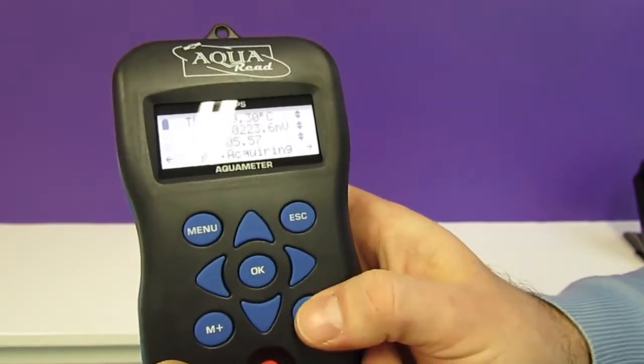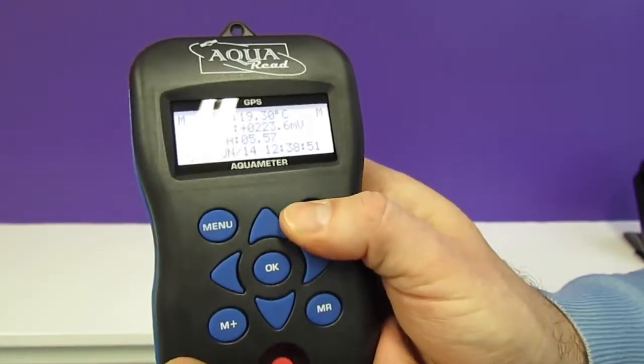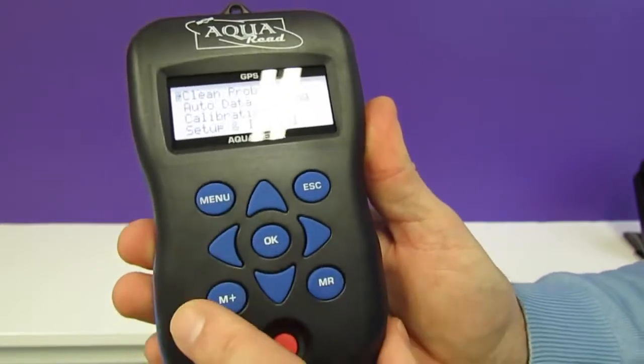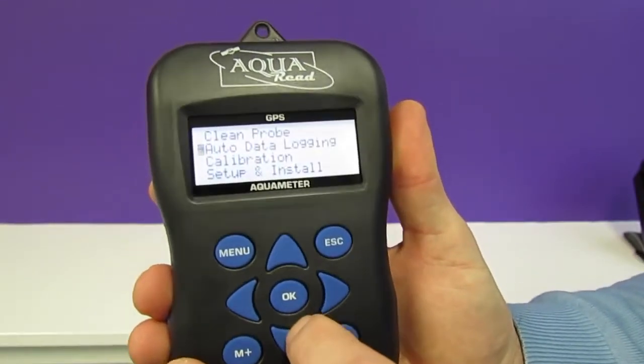We can press the memory recall button to view that data. The menu opens up a simple set of options which allow you to set up things like auto data logging.